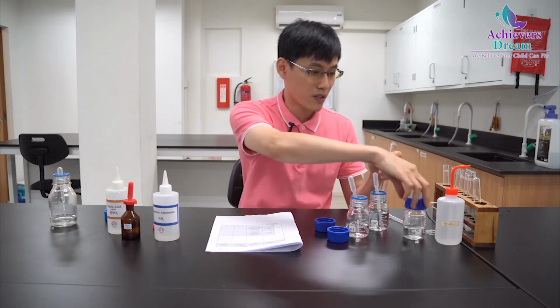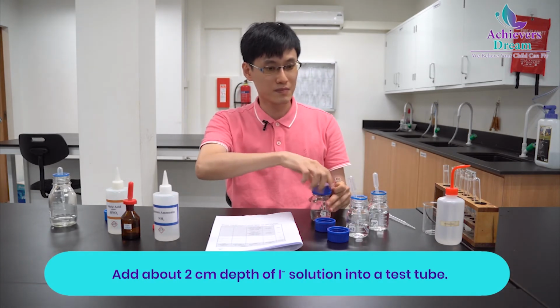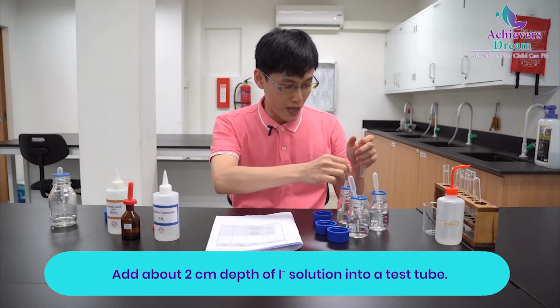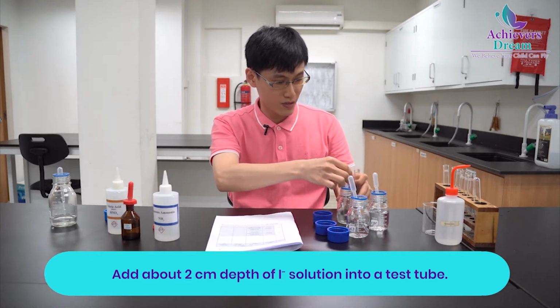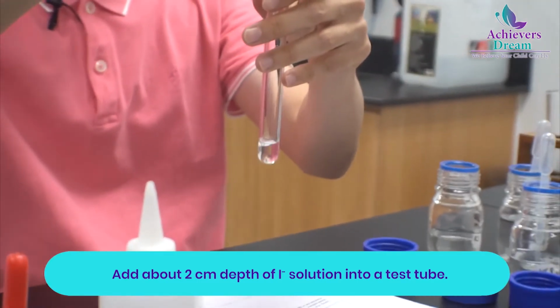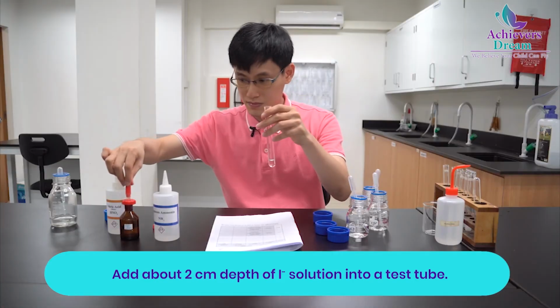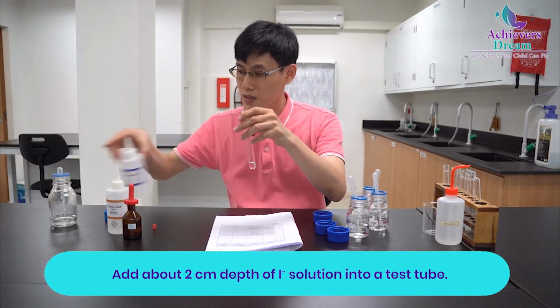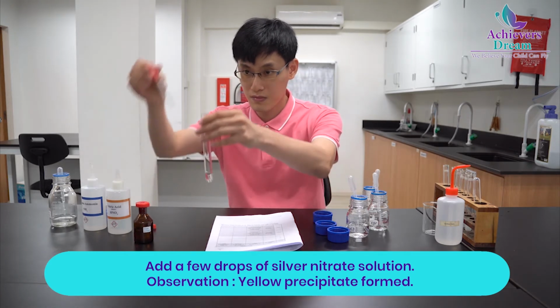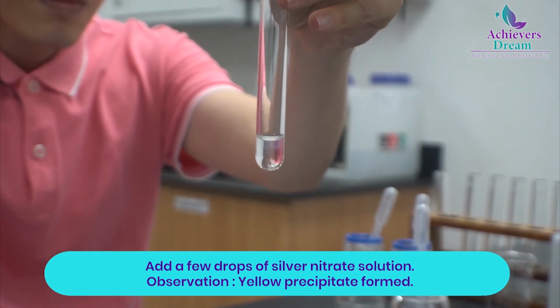Now let's do the test for iodide. Okay, so I'm going to take my potassium iodide and we are going to add 2 cm depth of potassium iodide. Okay, silver nitrate is coming up. Let's see what happens.